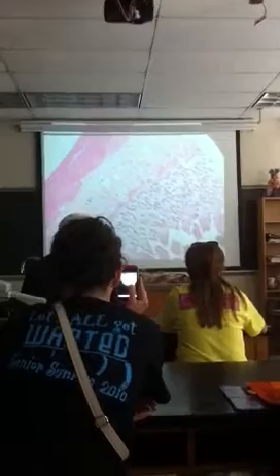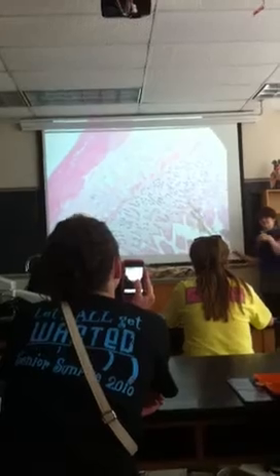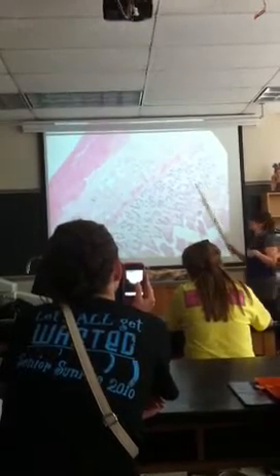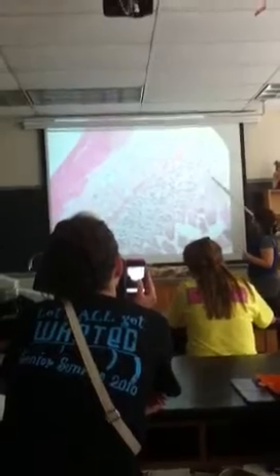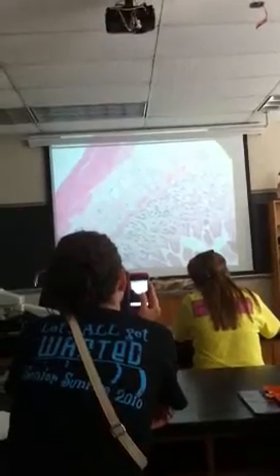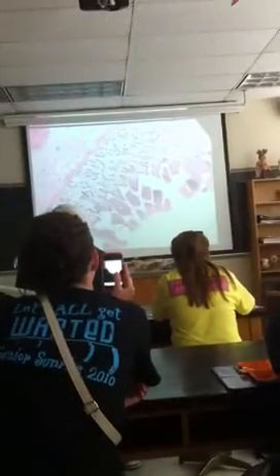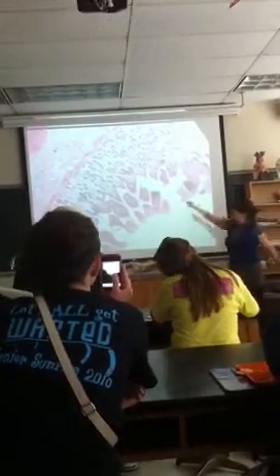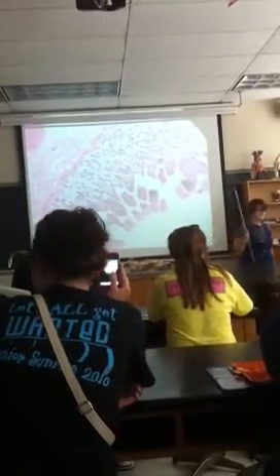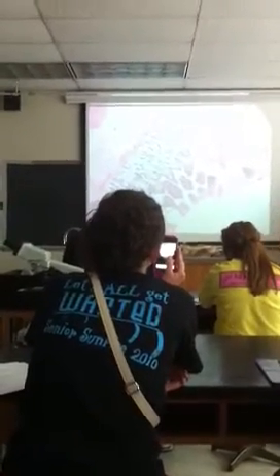And of those, we have the layer that goes more toward the inside of the lumen of the intestine, where the food is actually going to pass through. And it's all this stuff here. And that is the mucosa, or the mucosal layer. Okay? So, all of this stuff right here. And these little projections that come out are called plica, or plica circularis.